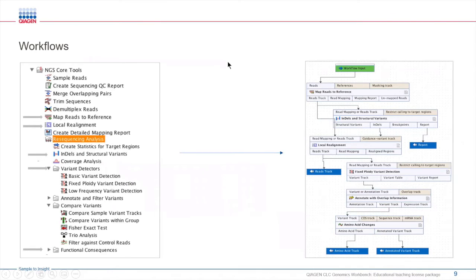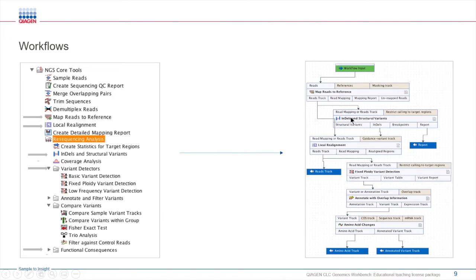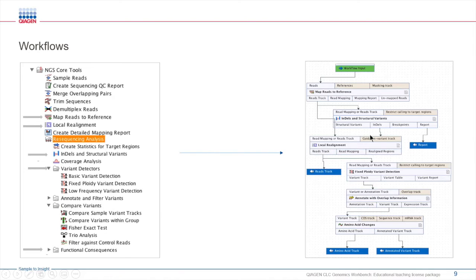One of the powerful features of the workbench is that it offers workflows that you can use, customize, and create. These are pipelines consisting of interconnected tools within the workbench, which are extremely useful to simplify and automate your data analysis. Instead of doing things one by one, you can simply set up a workflow and run multiple samples through a series of multiple tools using the same parameters with just a click of one or a couple of buttons.